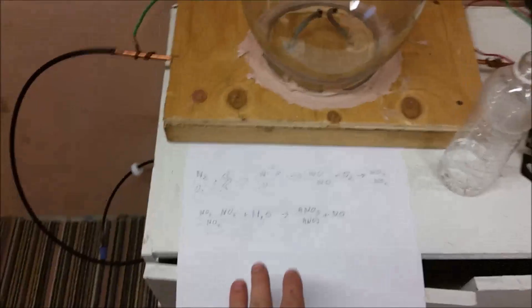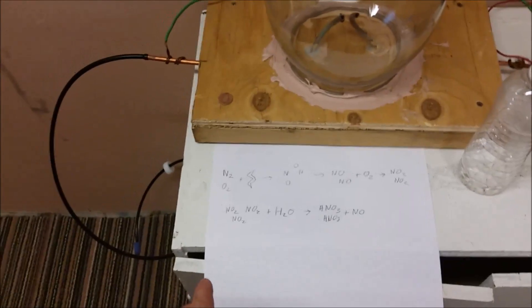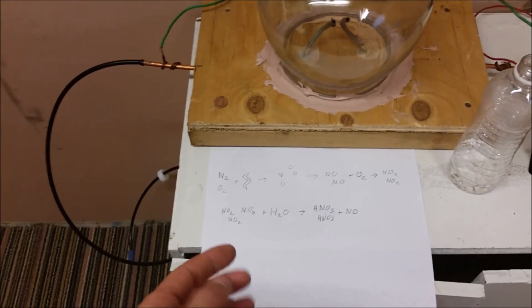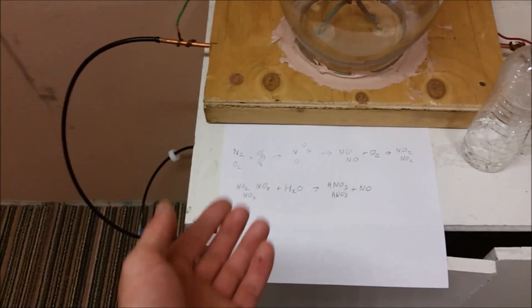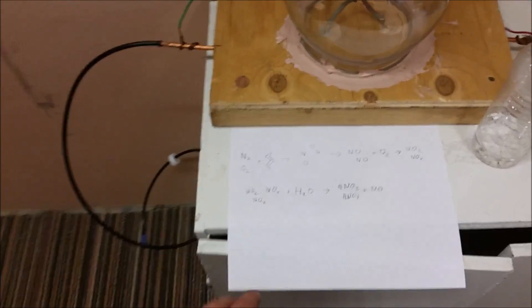Hi everyone, Cody Dawn here. Today I'll be showing you how to make nitric acid using electricity, air, and water. I'm going to be using the same process that forms nitric acid naturally, like in lightning.